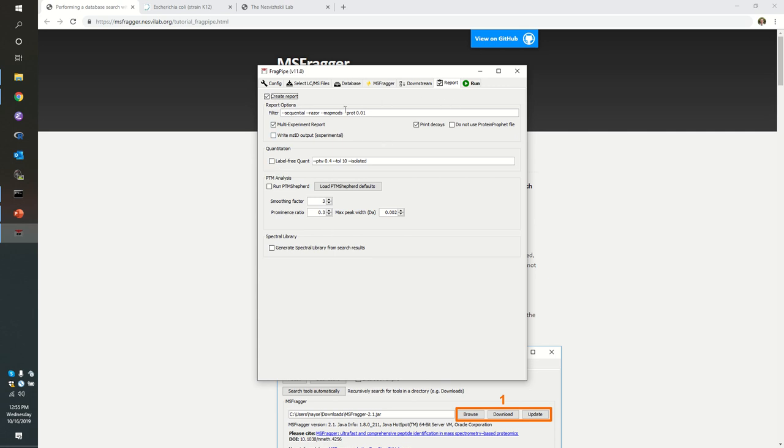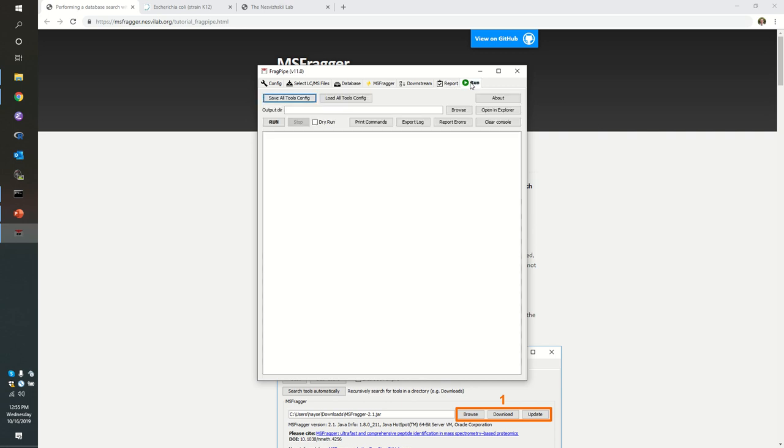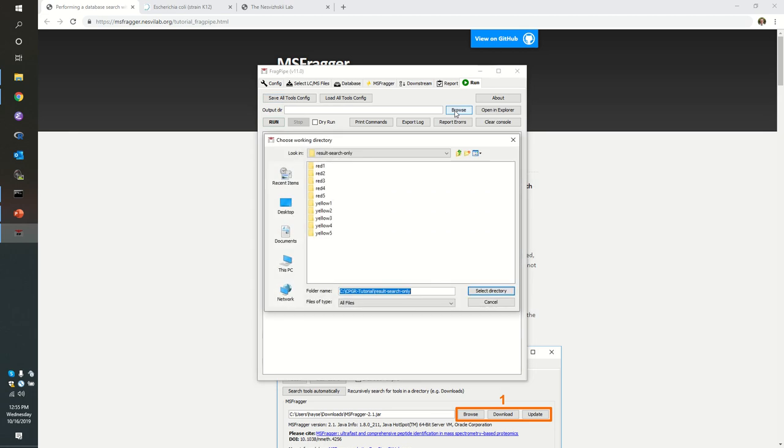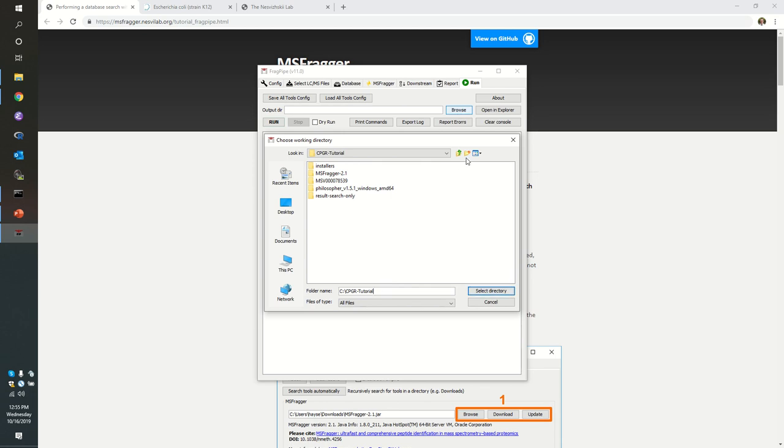So we've got create report checked, multi-experiment, and print decoys. Let us move on to the run menu. I need to tell it where to store this result. In the last run, we created a directory called result search only. This time, I'm going to create a new directory. I'm going to call this one result all philosopher.